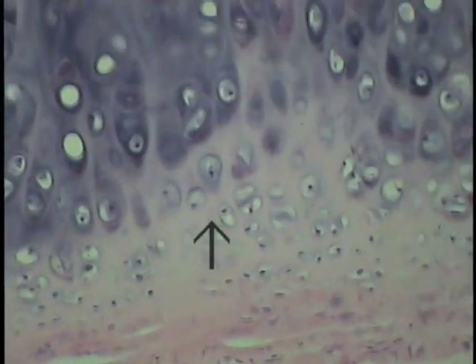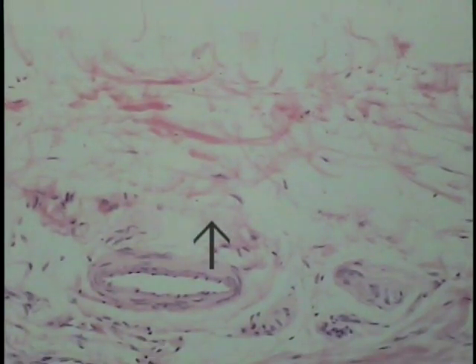And then finally into the classic hyaline cartilage plate, moving beyond it, and then getting into the tunica, or the adventitia, surrounding the tracheal wall and uniting it to other structures. You can see there are various calibers of vessels, nerves, and this loose but tough connective tissue anchoring membrane.